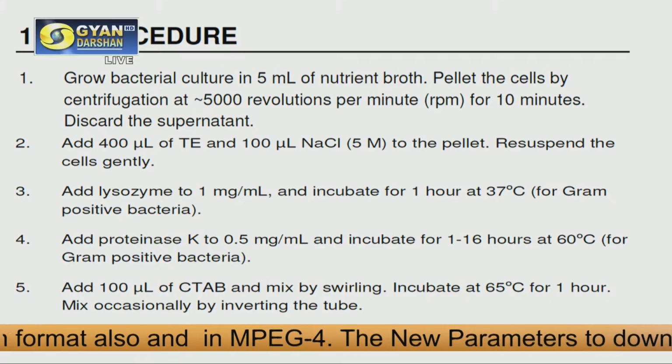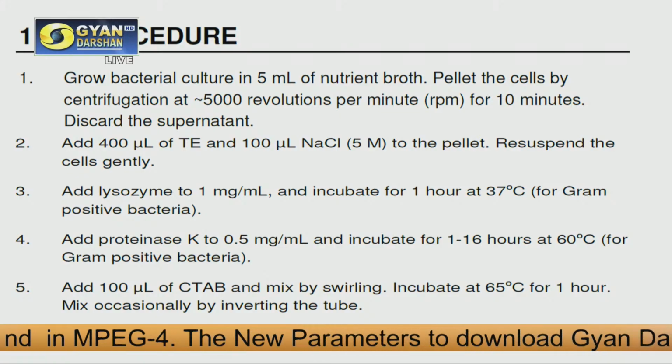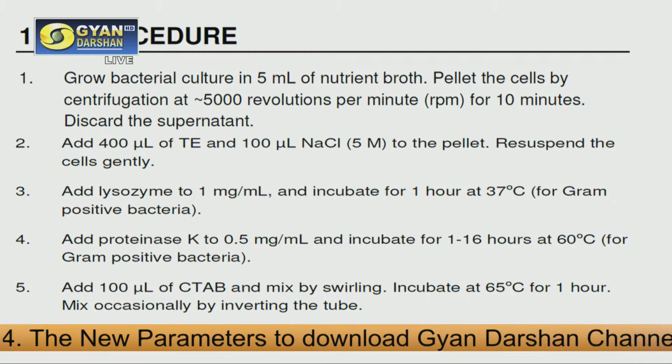Why are you adding RNase A? Because you don't want RNA. You want to avoid the RNA contamination. So you are adding RNase A, another enzyme which will degrade the RNA, but not the DNA.